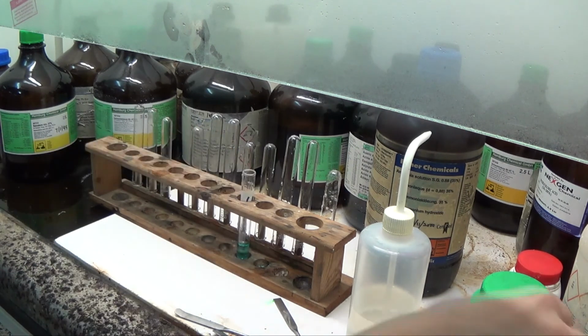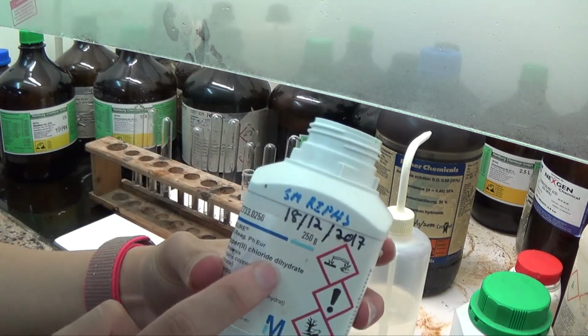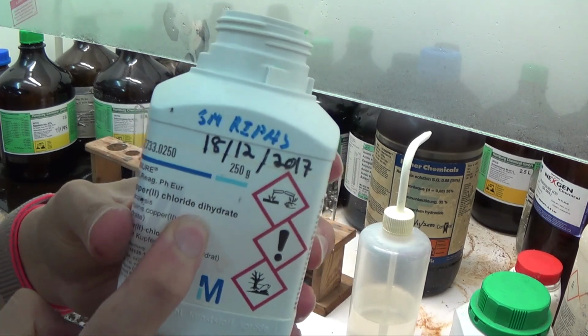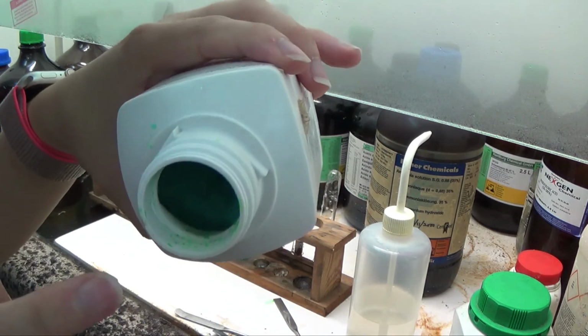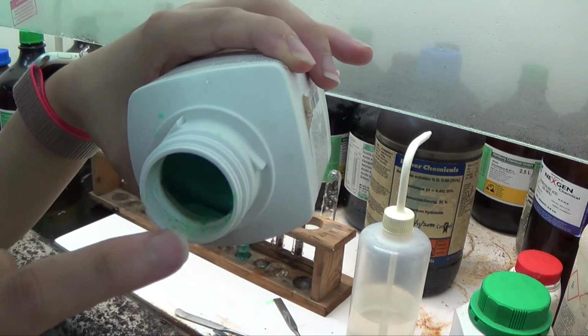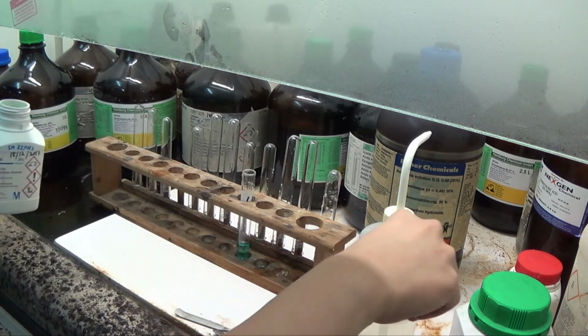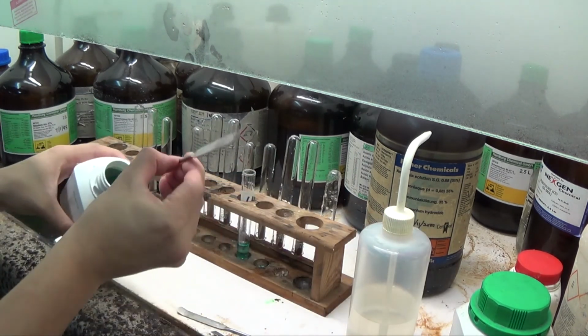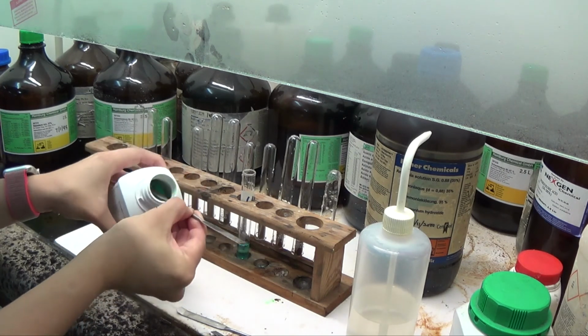Okay, so as a solid, this copper 2 chloride dihydrate, the dihydrate is a water of crystallization, so it looks a bit greenish. As you could see, it's a bit greenish there because in a small amount of water, okay, now I can see where it comes from already.